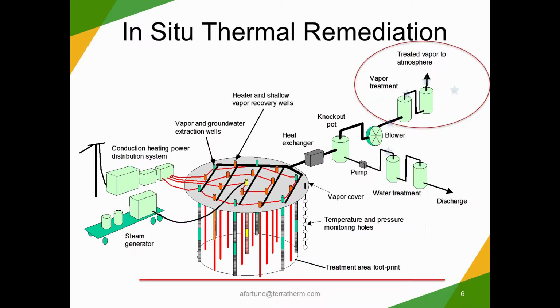So what we're generally talking about here for the FTIR monitoring in this case study, we're focusing on the treatment equipment area. So we had extracted vapor monitoring of the vapors going into and coming out of the treatment system, which in this case was a thermal oxidizer, and there were additional sorbent media backup systems. And then we also did some headspace monitoring over the liquid treatment vessels as well.